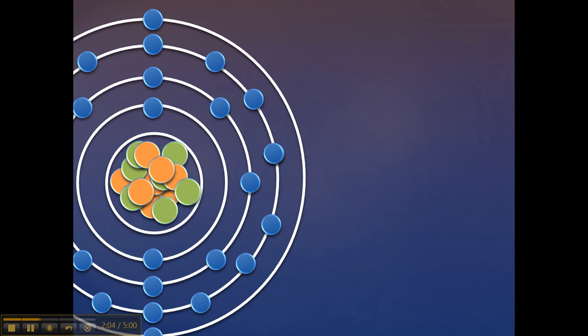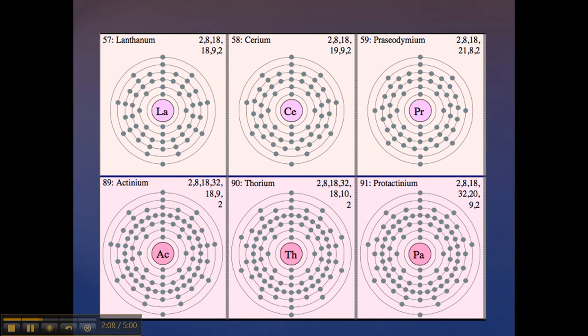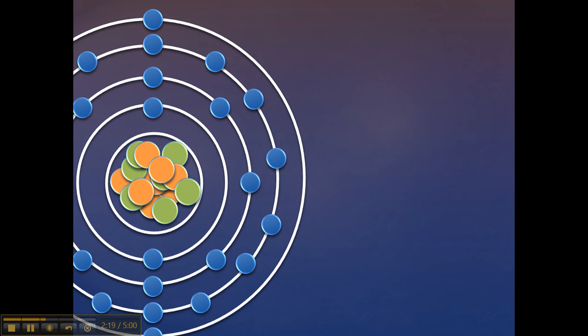The energy difference between each energy level for electrons is actually a specific number affected by the protons in the nucleus, or depending on the element. This means that the energy difference for an electron in an iron atom is different than the energy difference for an electron in a copper atom. If we add this specific amount of energy to the atom, then the electron will jump up to a higher energy state.